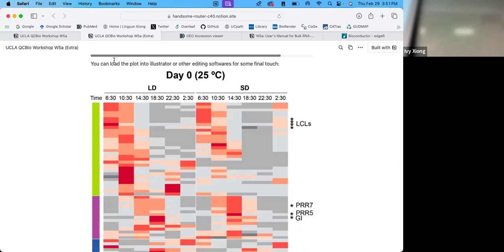I think what I did is I made that, and then I have files, but maybe I submitted. If I changed to my path, you might have to define the path. They are there, and it's that linked file.